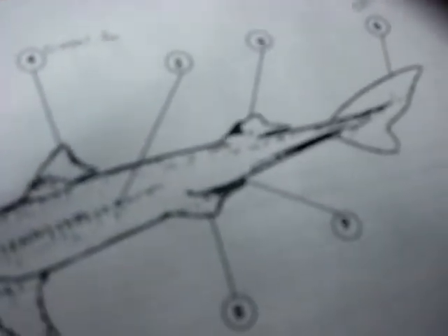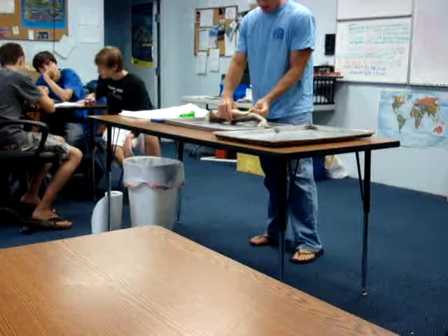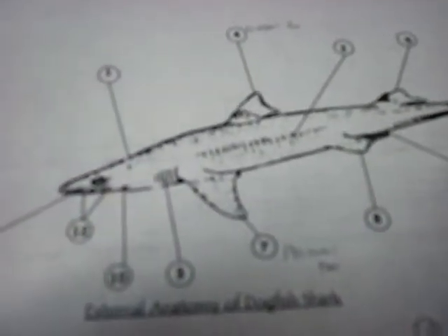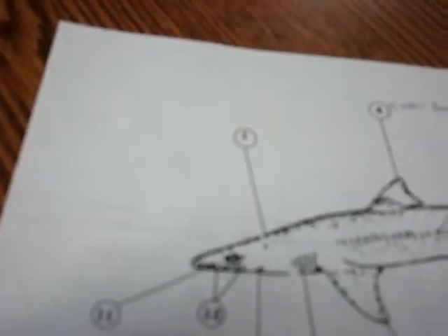Okay, and then if you flip this guy over, while we're on the fins. Caudal. Dorsal fin. Okay. What are these rear paired organs called? I'm sorry, not the organs, the fins. Let's start with the fins. Did we already miss this one? Can you go back a couple slides? I think no worries.